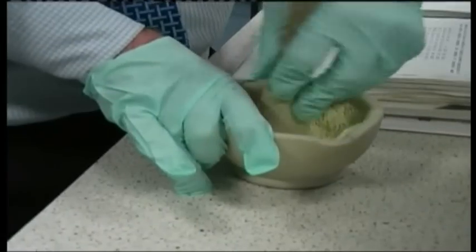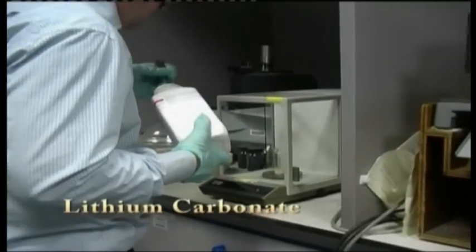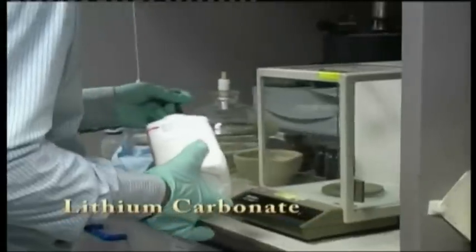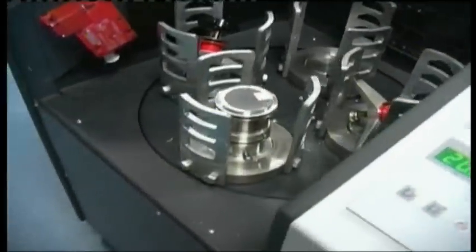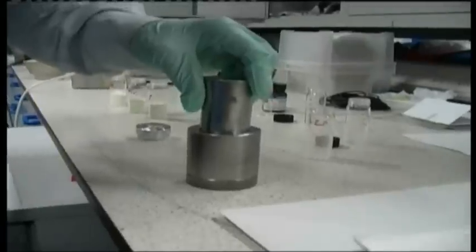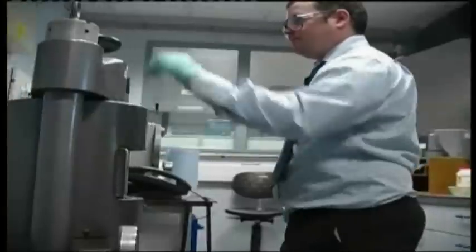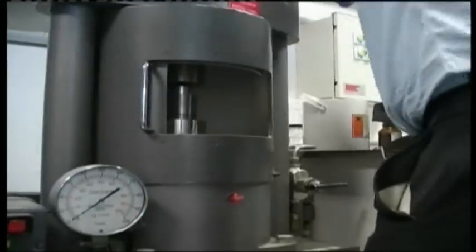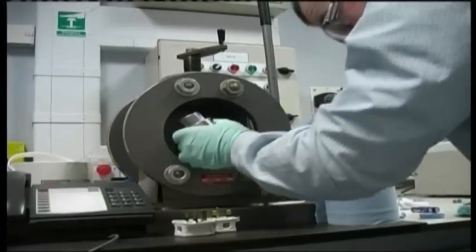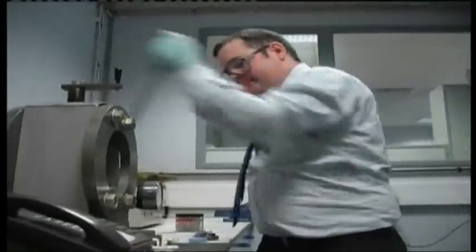Beginning by hand, Andy set about crushing one of Simon's samples. Even at this stage, Andy remarked on how pure the samples Simon had provided appeared. Both the standard sulfur and the Brimstone were then mixed with a binding agent, lithium carbonate. Next, it was mixed in a blender and then pressed in a machine to a compression of 40 tons. Having pulverized the samples under 40 tons of pressure, they now have to be removed from their containers. What they are left with is this.